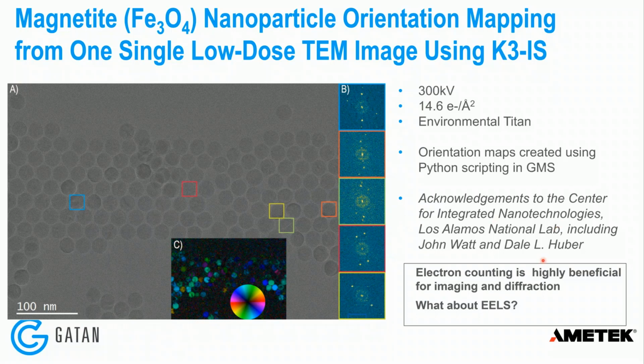Okay, so that's imaging, some nice image examples. We can see that we were already having some benefits for imaging and diffraction, but as this is an EELS presentation, what about EELS?